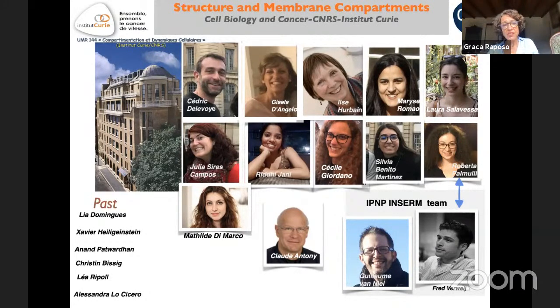One important thing: when we don't know an antibody and an antigen, we have to be sure by immunoblot that you have one single band. It's extremely important not to start buying commercially available antibodies without testing them, because a lot of these antibodies sometimes recognize different proteins. There were a couple of examples like that. So you really need to know your antibody. And then you can fix your samples when you don't know.